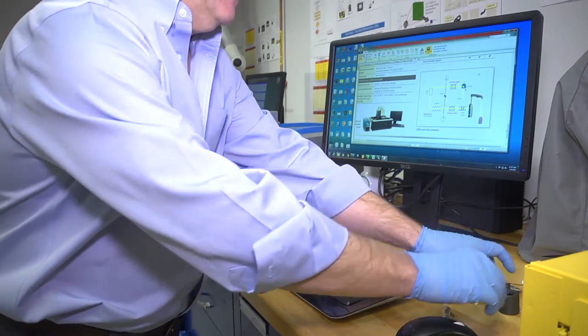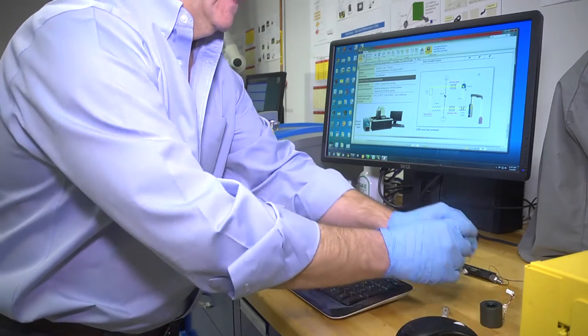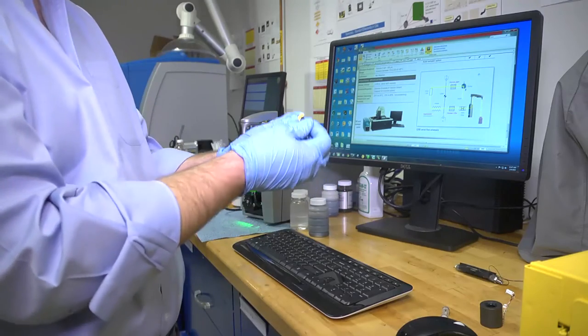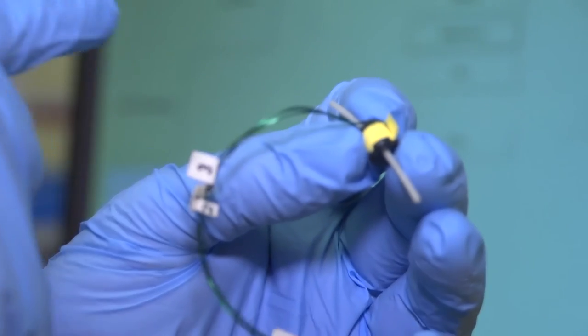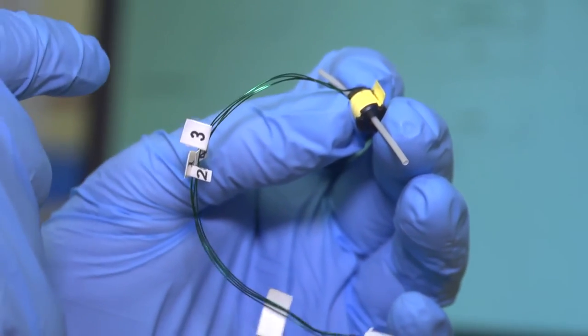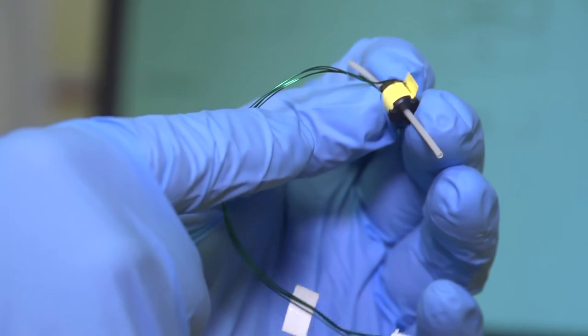That is this particular, the flow goes through this tubing, and then the individual ferrous events or particle count occurs within this magnetometer.